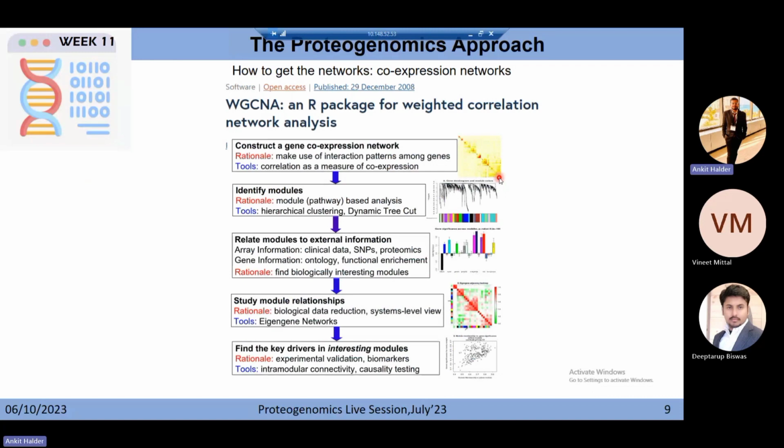So, where you are getting the correlation patterns among those particular variables. Now here, it is doing the same expression level, so according to the expression level you can find the correlation of your genes, how much it is correlating for your particular condition.